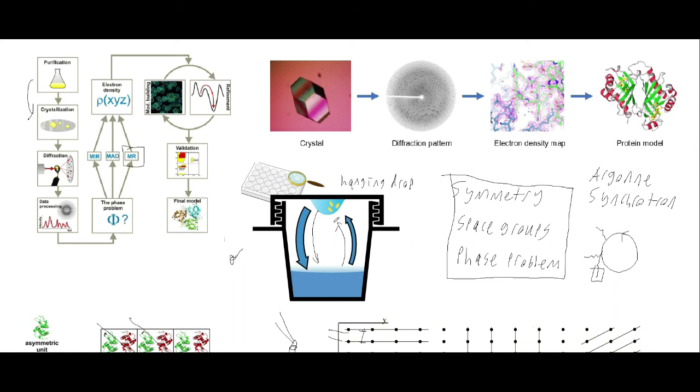There are other methods, but the depth that we could have gotten into is looking for the various solutions that you can use to actually form crystals. So you adjust the pH and the various salt concentrations and everything of your solution, and you want to test. Sometimes you can test thousands, tens of thousands of different solution conditions before you find the right one to form crystals.